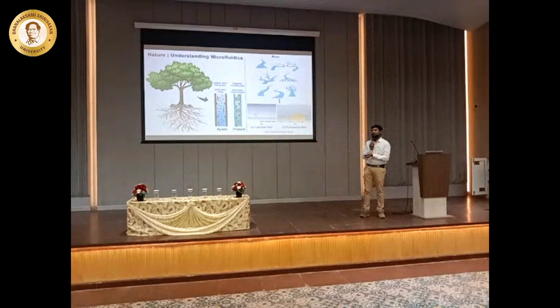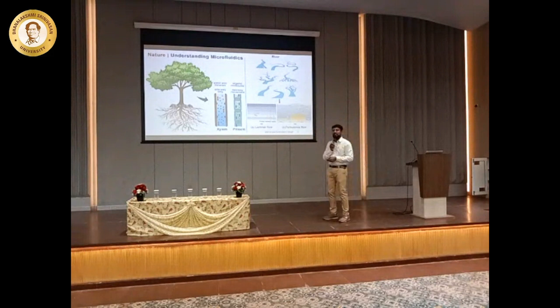This is what is happening. So I'm just making smaller structures. I'm making microfluidic channels wherein I can see two important, I would say major, phenomena that we could see. A microfluidic flow that can happen in a channel is either laminar or turbulent flow.